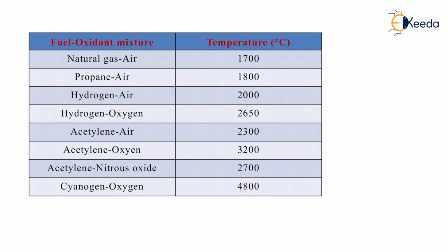So in both hydrogen as well as acetylene, whenever we change the oxidant from air to oxygen, the temperature rises significantly.